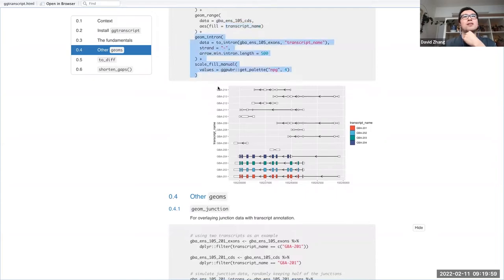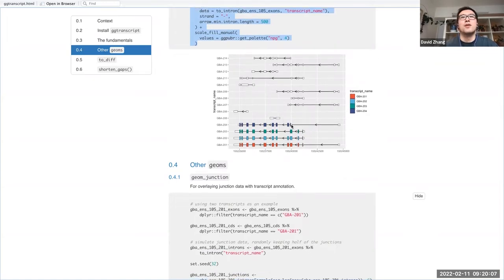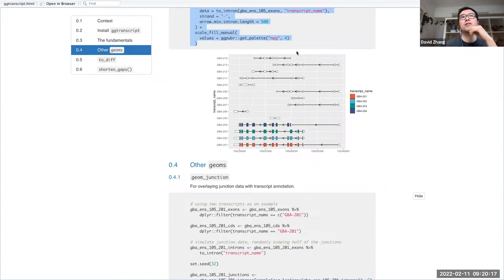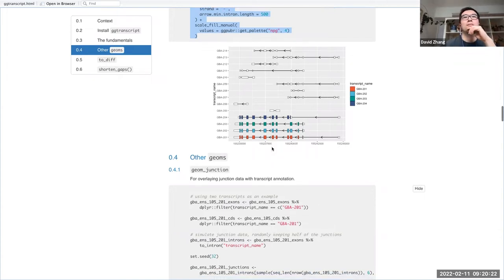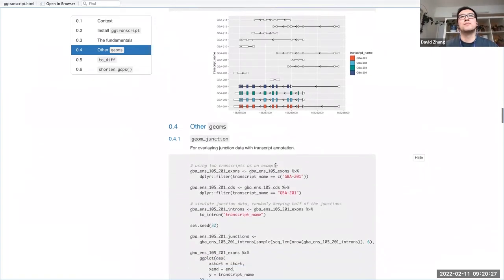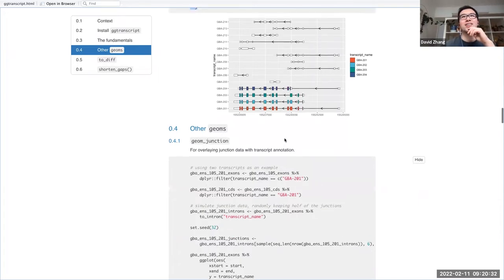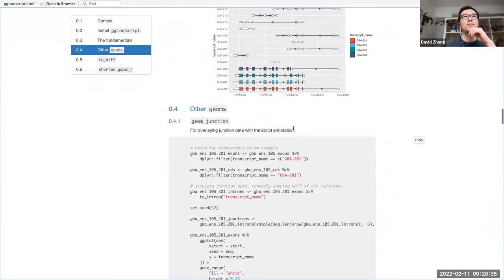We fill by transcript, then add the introns on, and this is the kind of plot you might end up leaning towards. Obviously the CDS is only present for protein coding transcripts, so it might make more sense to filter out non-protein coding transcripts from the plot — but that would be pre-processing of the input data. Apologies, I put this together quickly for today.